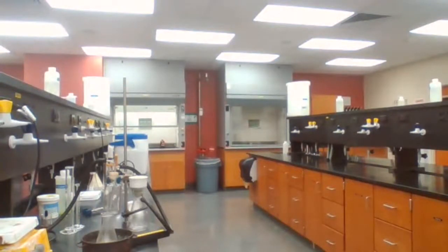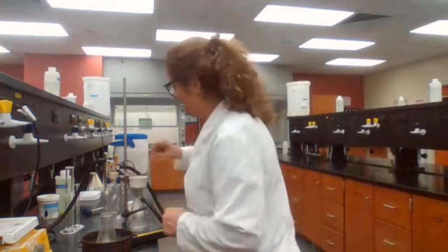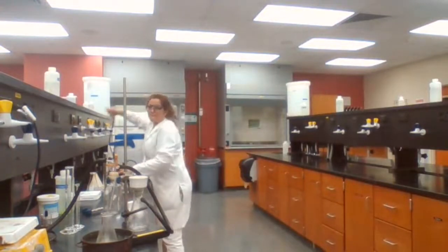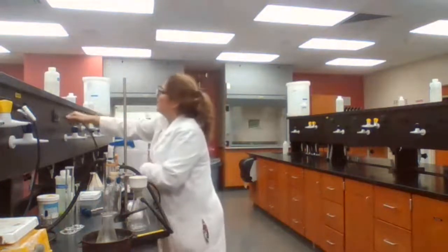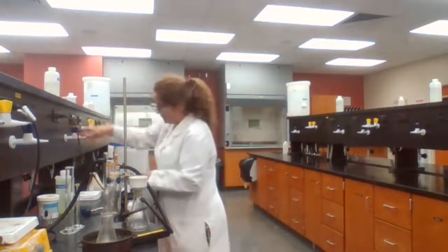Has it been 5 minutes? Yes, looks like it, right? So we are going to place the filter paper inside the vacuum funnel, or the Buchner funnel.